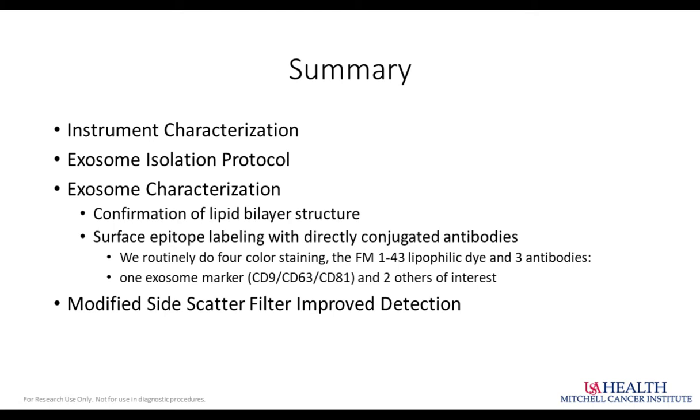It's kind of crazy. I really think it's best to go back and look at that slide where I've got the 3 successive spin speeds lined out, because that's the best way to wrap your head around it. At each higher level of G-force, you're going to pull down a smaller and smaller particle. So the largest of these are considered apoptotic bodies. These are blebs that are spit out of cells as they're undergoing the final processes of apoptosis, where the cell is literally ready to break down.